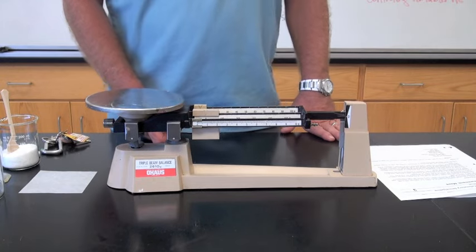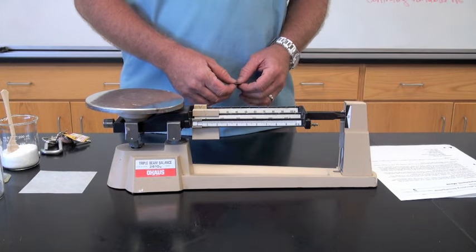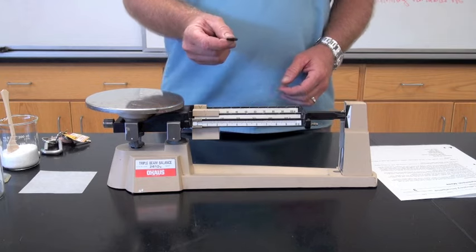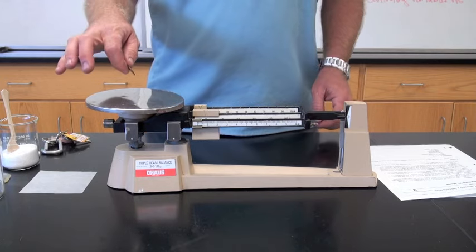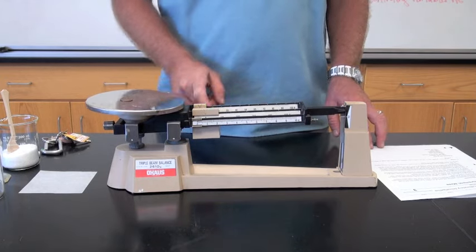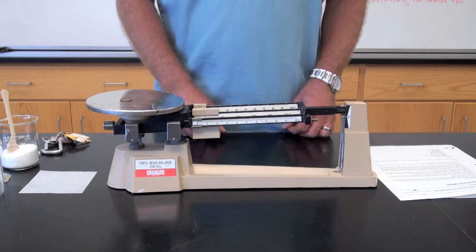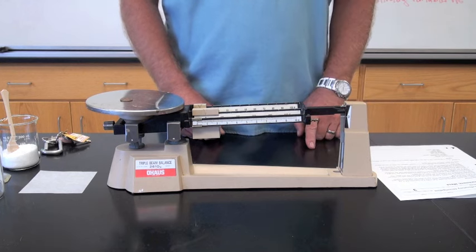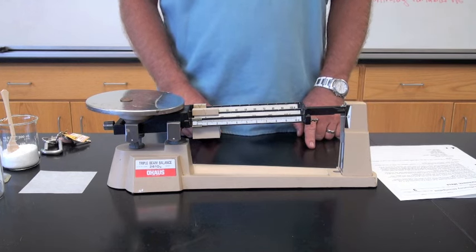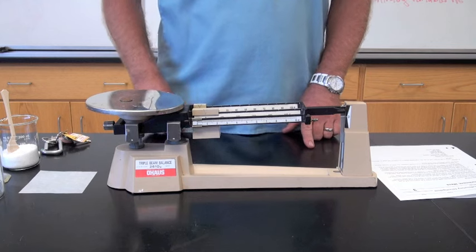The first way to measure an object using a triple beam balance is to measure mass directly. For this, you place your object directly on the pan of the balance, and the riders are moved into position on the beams until the pointer is balanced at the zero point. The mass is determined by the positions of the riders on the beam.